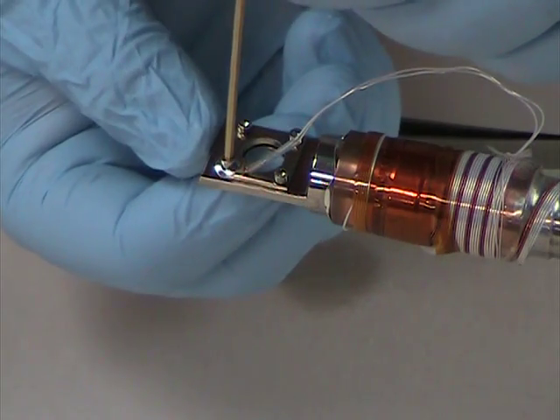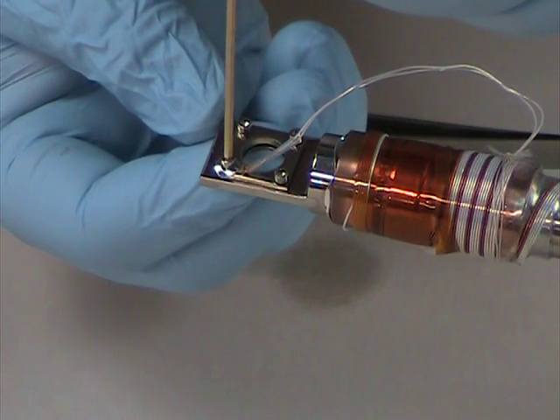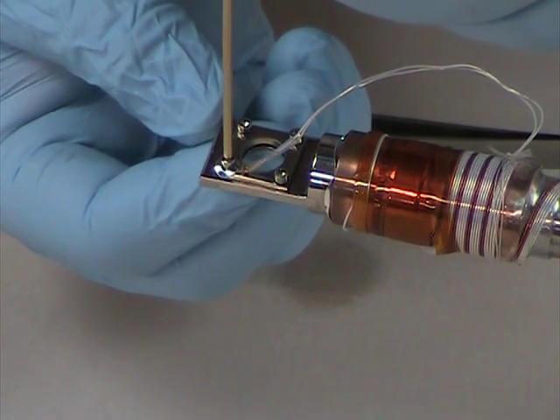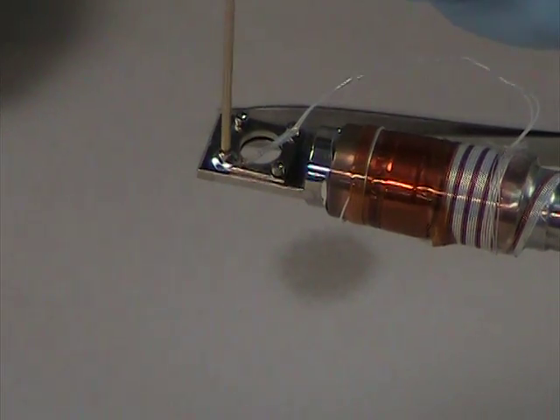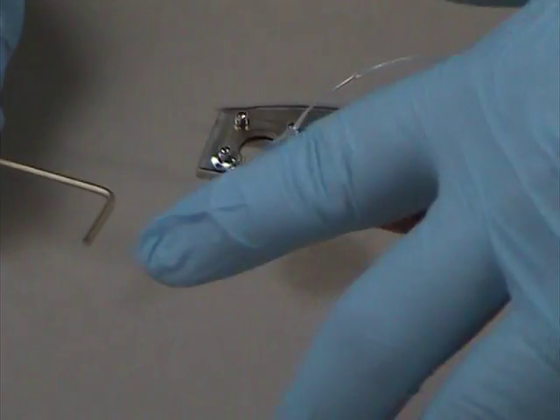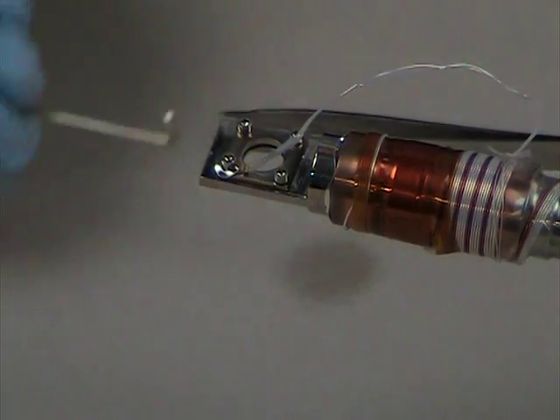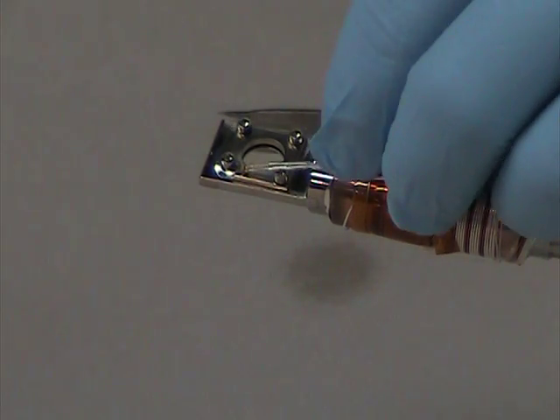One thing to be careful of as you tighten down the sample sensor is to use very little force. You want just enough to make good thermal contact, but if you put too much force on, you'll crack the diode. Another thing to be careful of is that you don't push the sensor in too far and have the edges touch the screw holding down the sample holder. This will cause a short and give you a bad reading in your sample sensor.